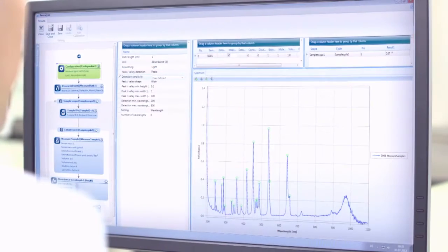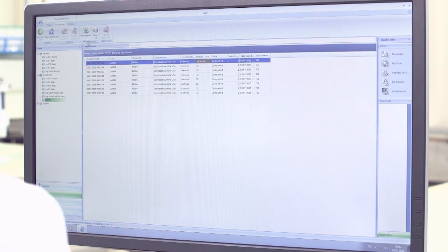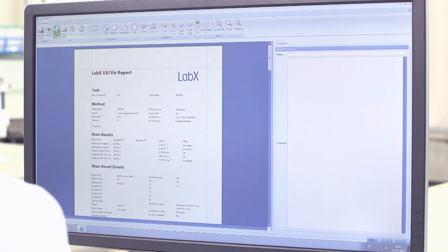With the powerful re-analysis tool, it becomes easy to fix input errors and analyze final results. Templates allow for immediate report generation, be it an electronic record or a hard copy.